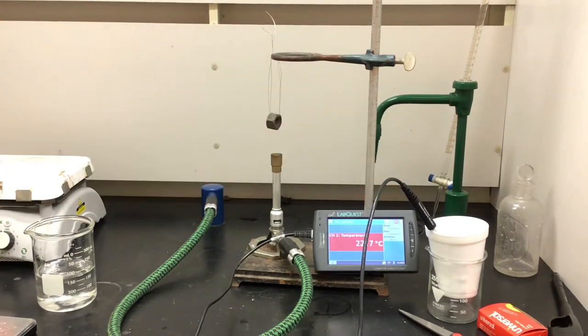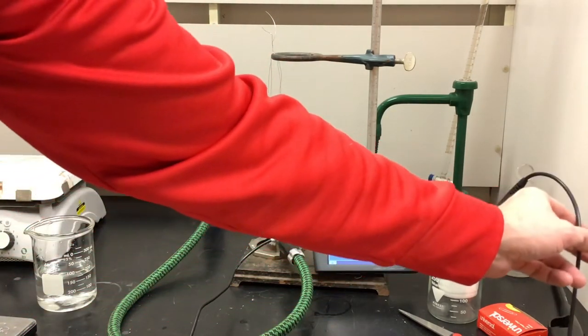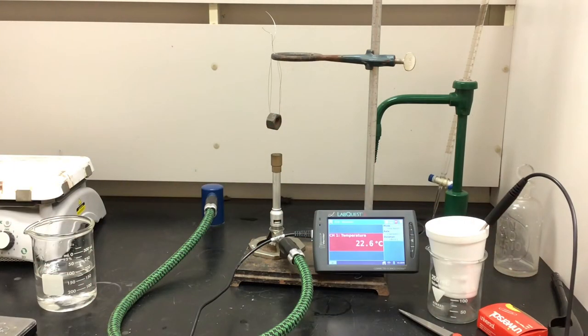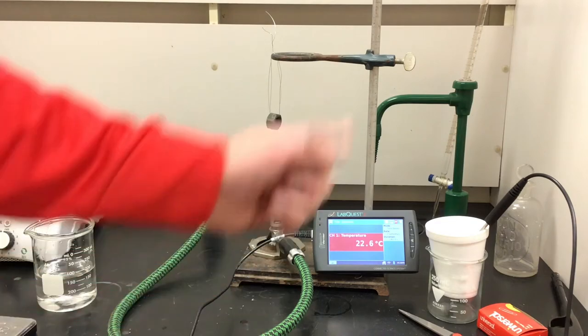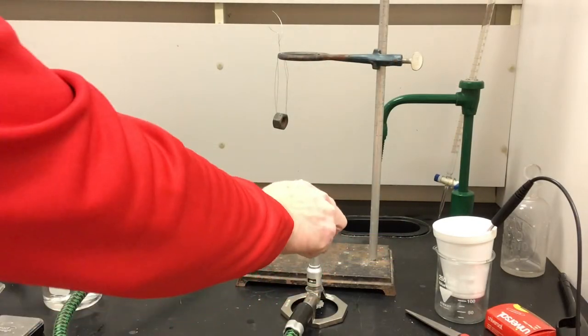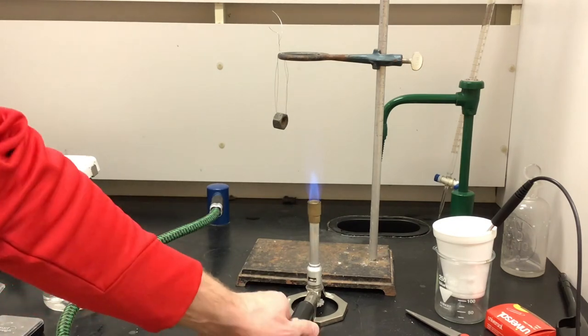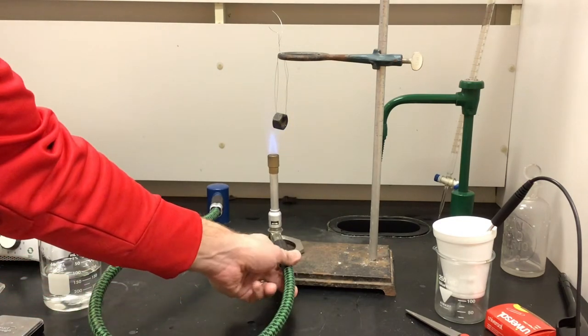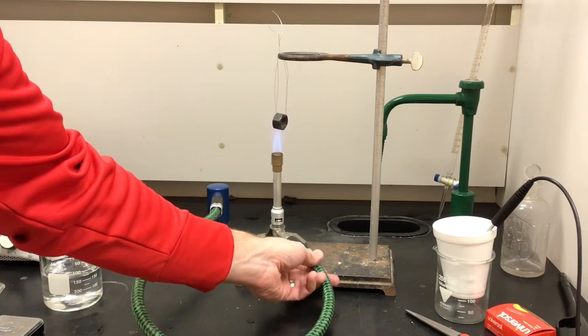As we continue to get the lab set, we know a couple things about the water. We know how much water: 200 grams, 200 milliliters. We know the initial temperature of the water, 22.6. We'll verify that prior to the addition of the bolt into it. We know the specific heat of water which is one calorie per gram degree Celsius.